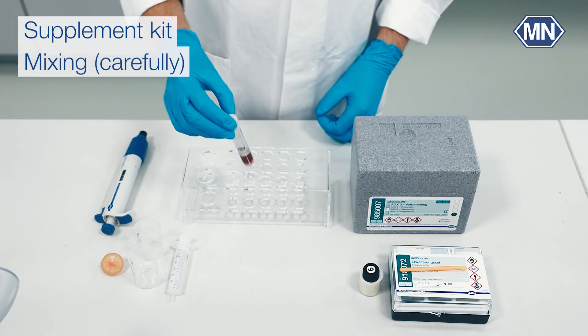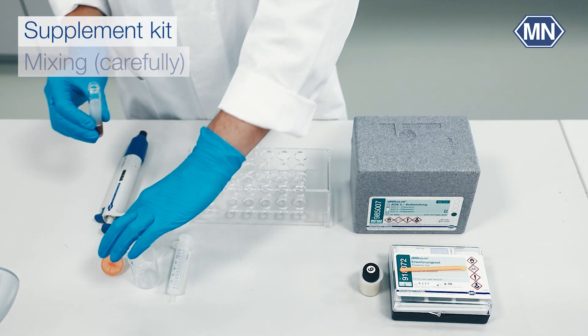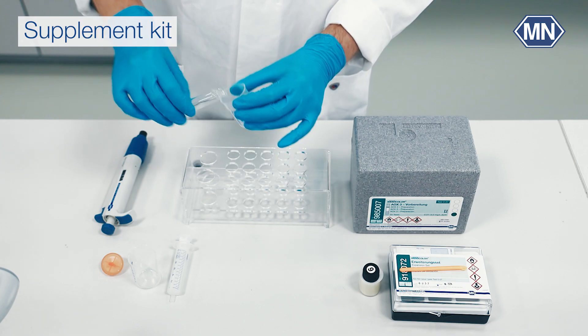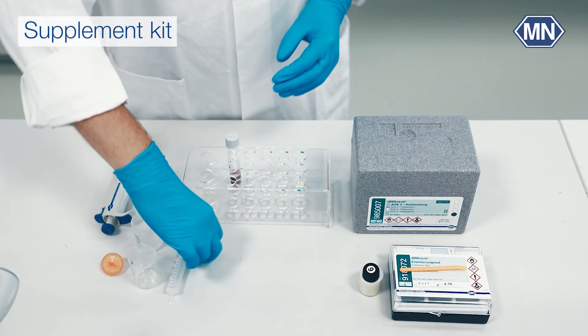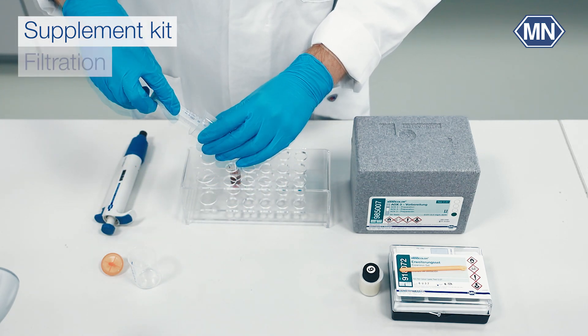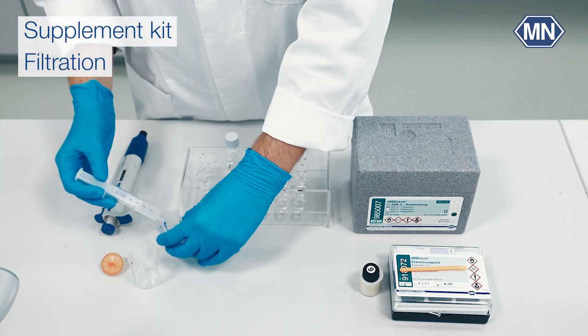Again, shake the tube and make sure that the Nanofix R3 remains at the bottom. Pour the liquid into a beaker. Attach the adapter to the syringe and collect the liquid from the beaker. Filter the solution through the syringe filter.